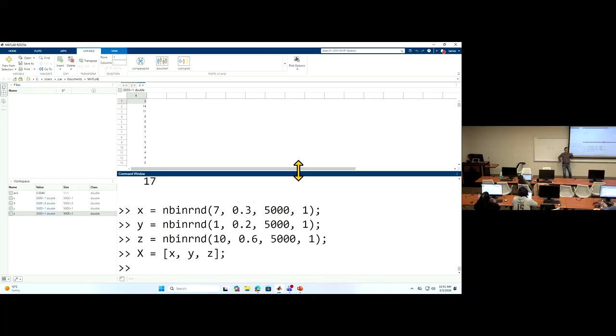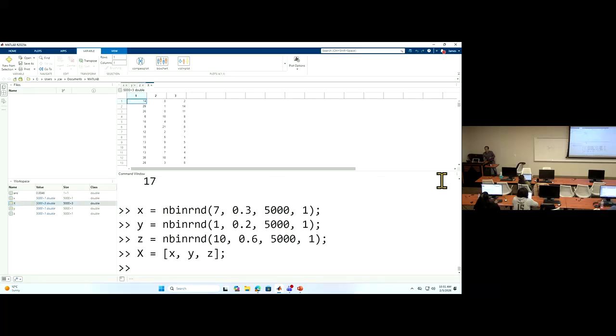If you look at the big X, it looks like real data. Okay? If I don't tell you, you may think, okay, this is extracted from a real single-cell RNA-seq experiment result. So that's the purpose of simulation. You do this.